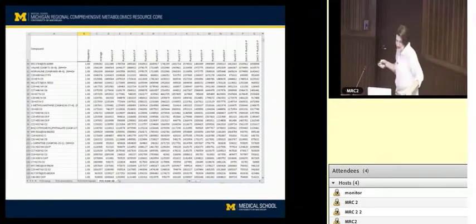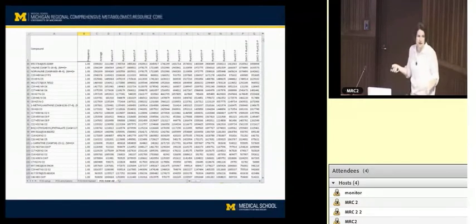And that's fine, because if you're going to go on and do any kind of further analysis with this, then having an accurate mass and a retention time are probably 2 of the most important pieces of information you need. So again, these are all those unknowns that the different people in the group have been talking about.